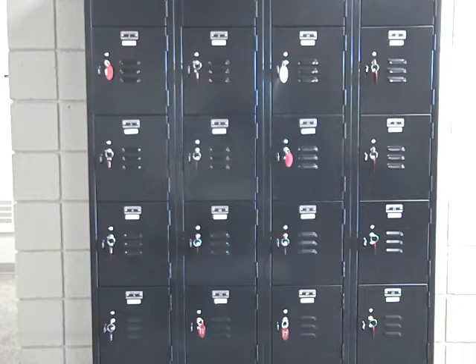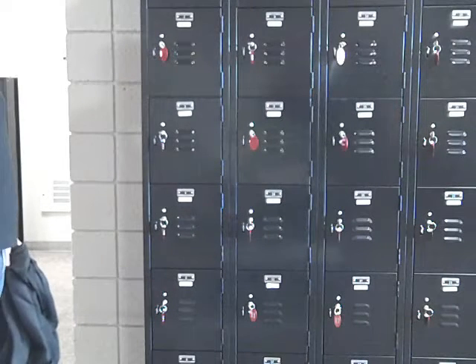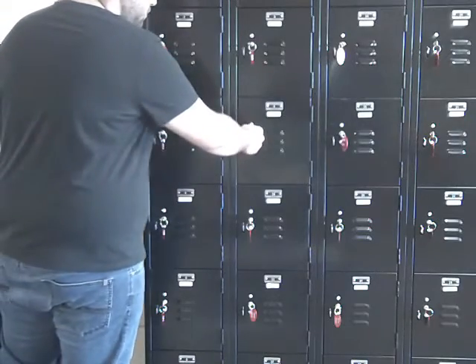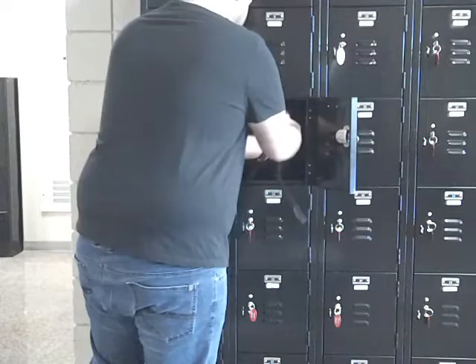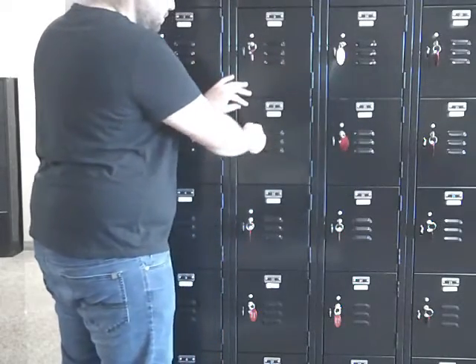Today we're going through some of the safety procedures for the microbiology lab. Store all your personal belongings, including food and beverages, in your assigned locker outside the micro lab. Take the key with you and store it in your assigned lab drawer.